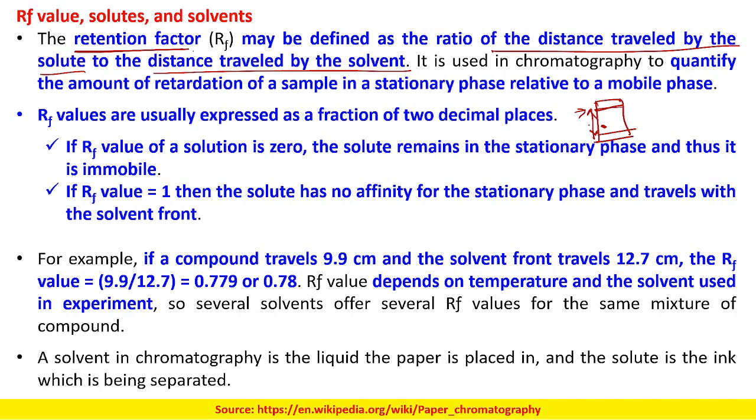This distance is the solvent, what do you call, this is the solvent front, say R sol, and this is the R solute.